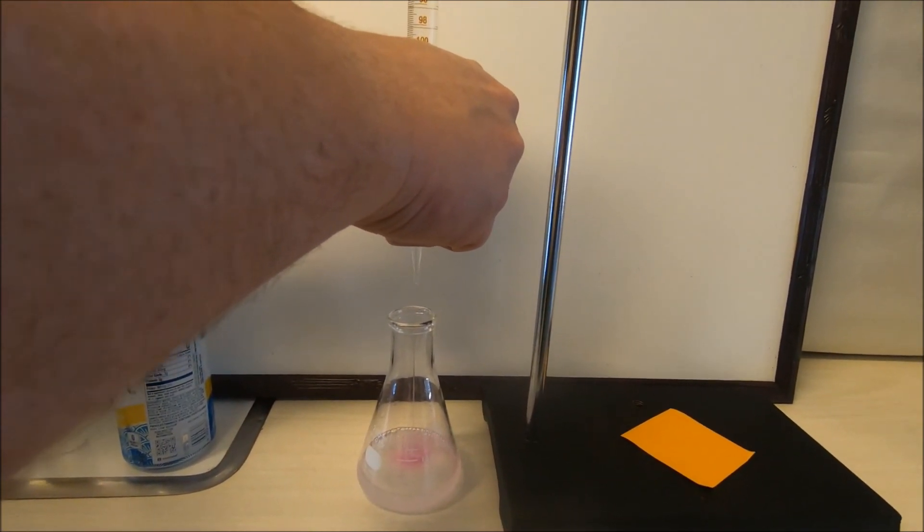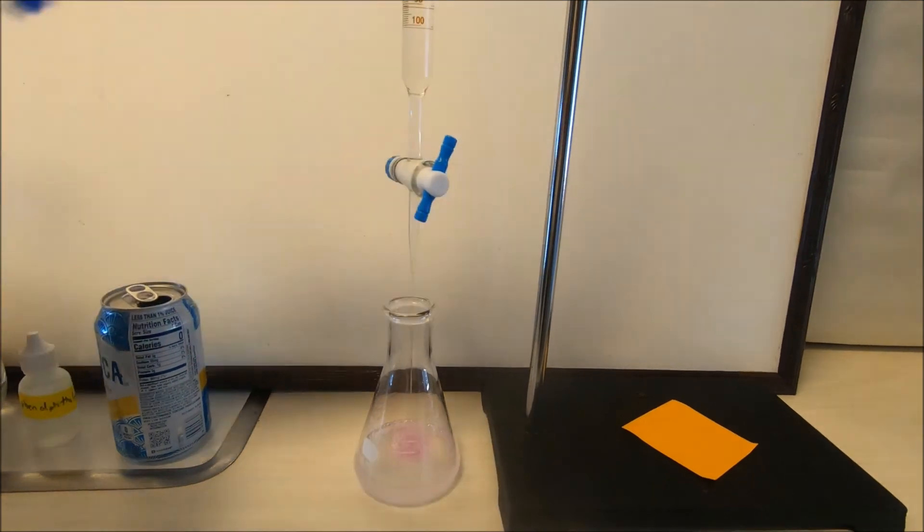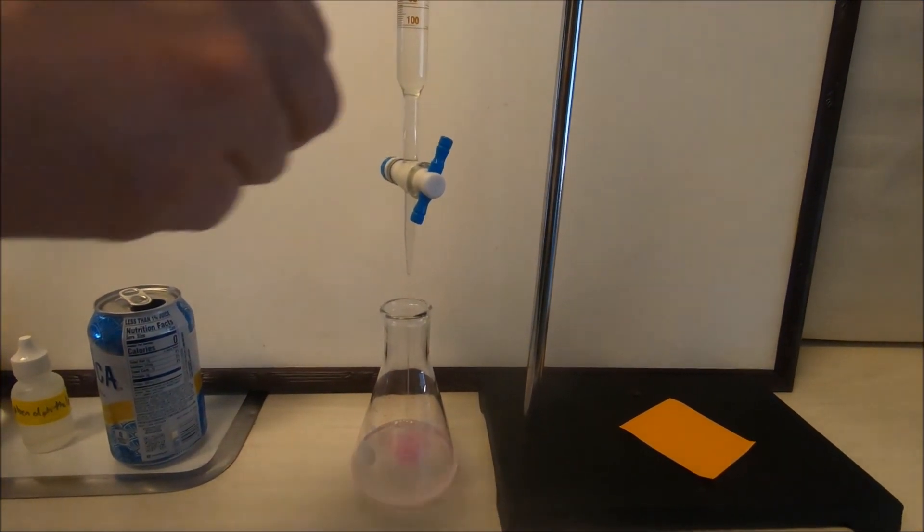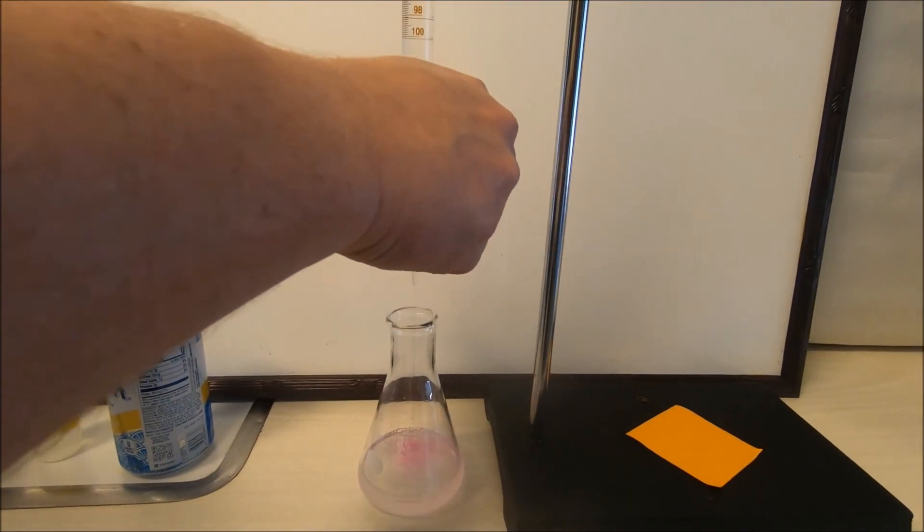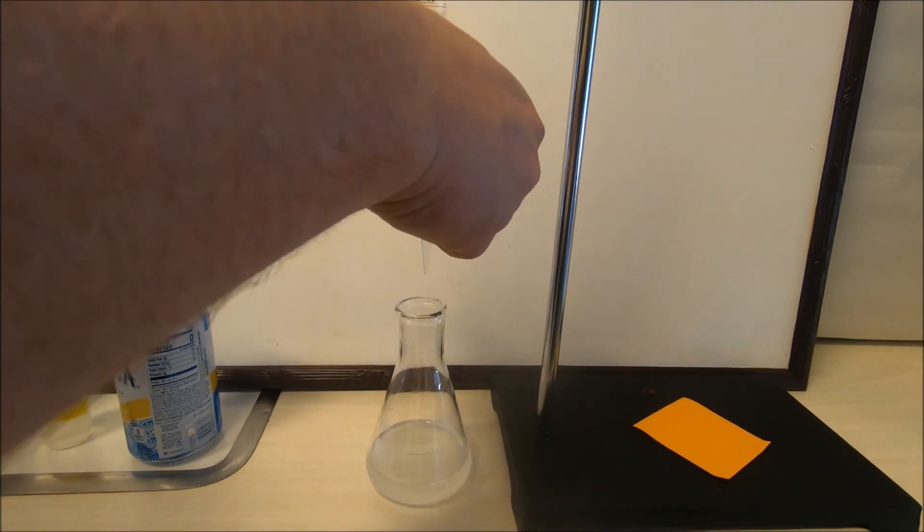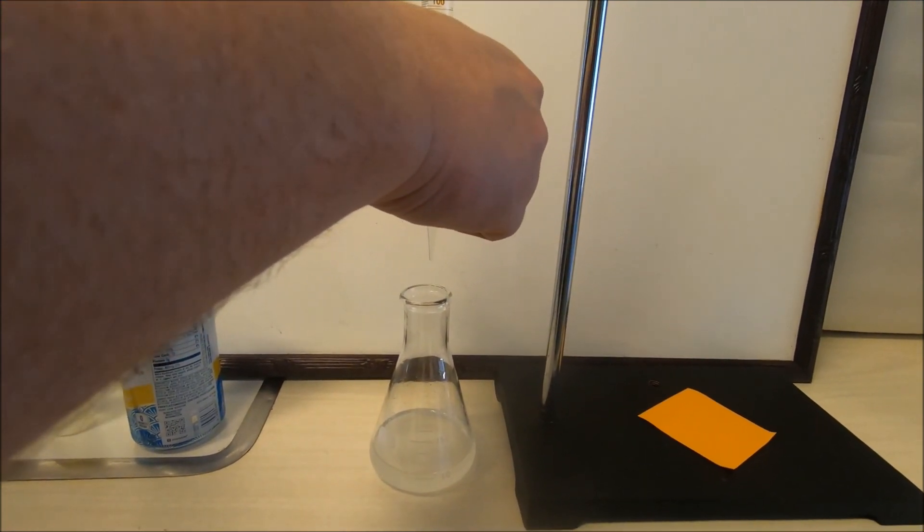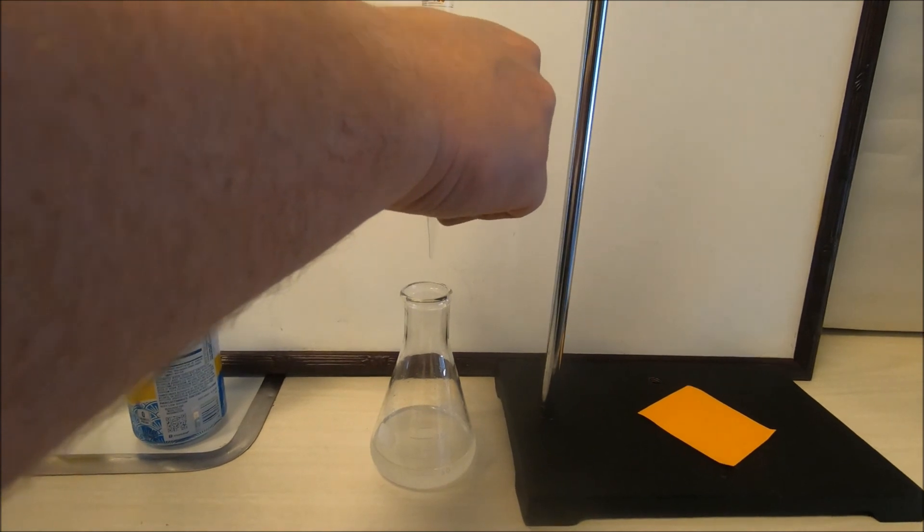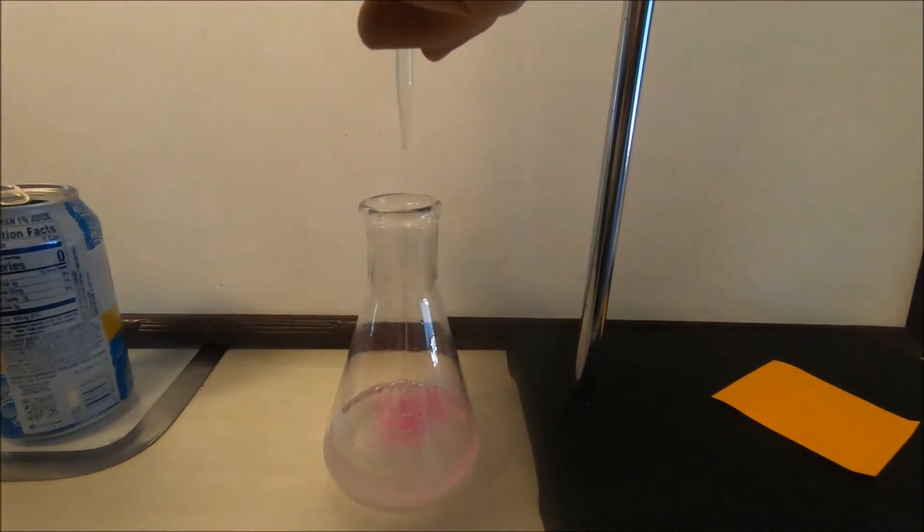We can notice that right away we're starting to see a pink color form, but that pink color is going away right away. Anytime we turn it back it goes back to its original clear color because that sodium hydroxide is neutralizing the acid, but there's still more acid present.